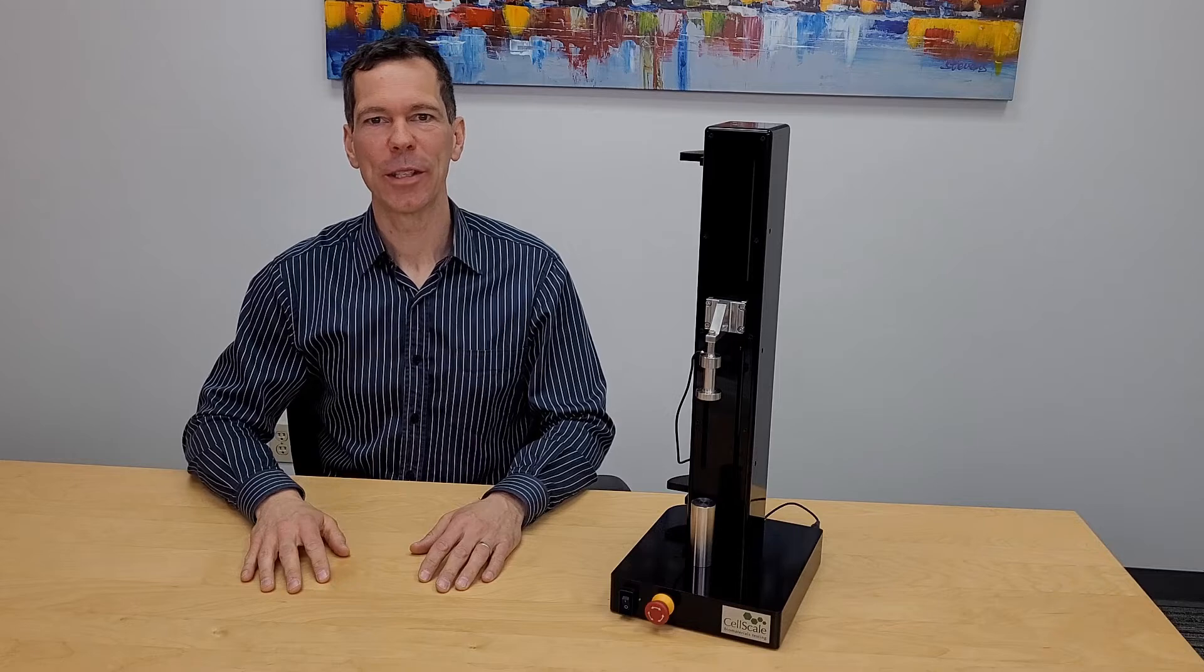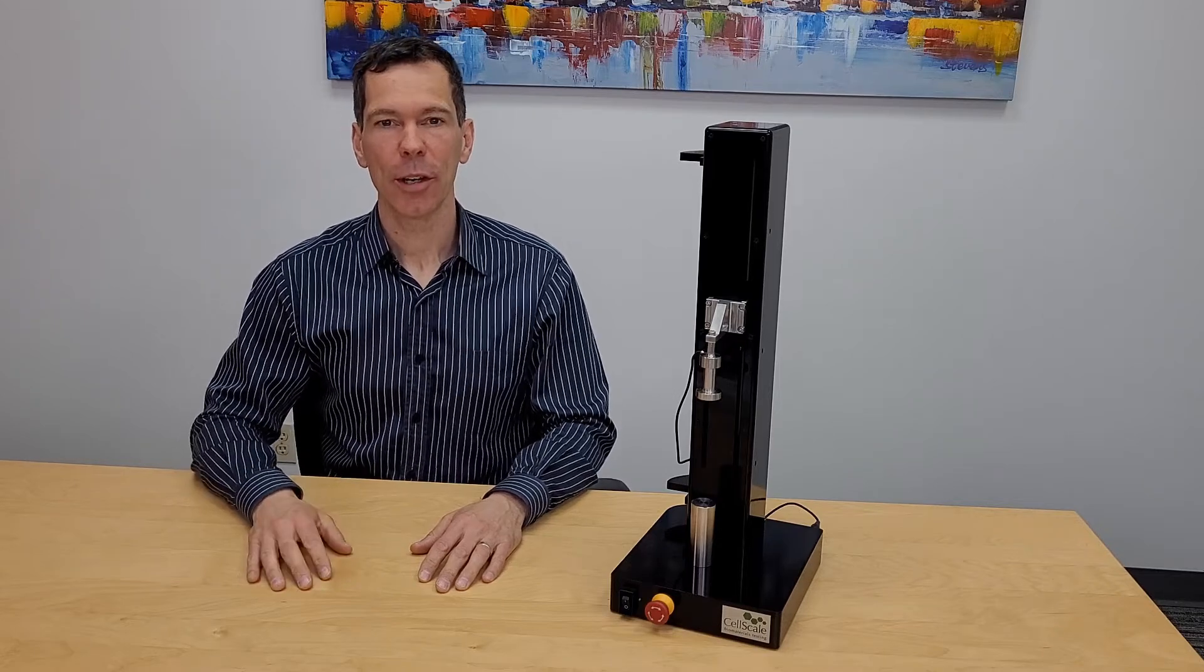Hi, I'm Caleb Horst with CellScale Biomaterials Testing. Today I'm going to be talking about the new generation of our UniVert Mechanical Tester.